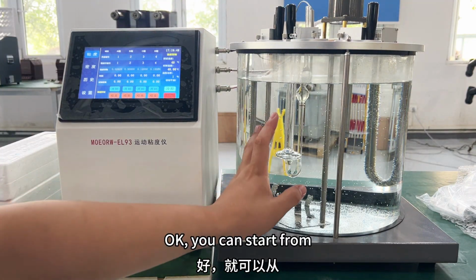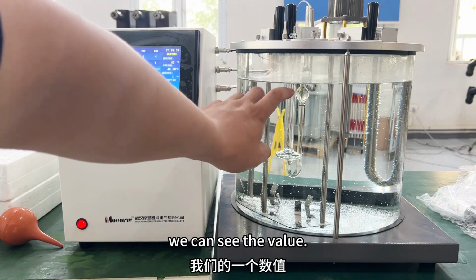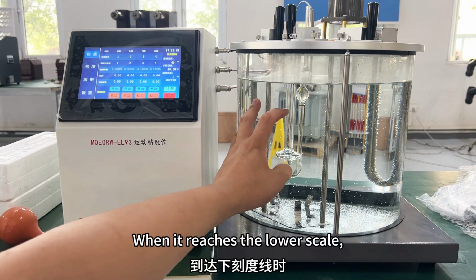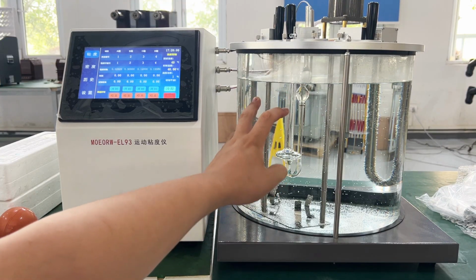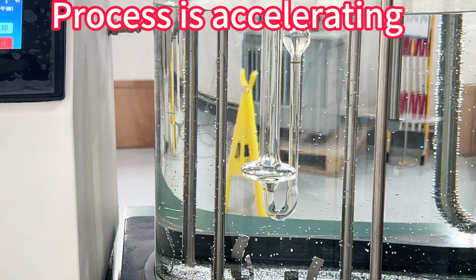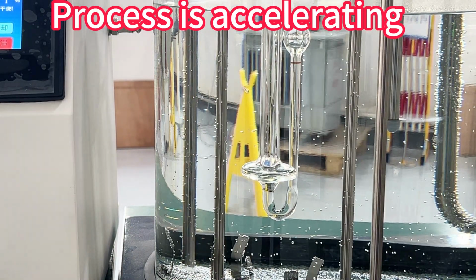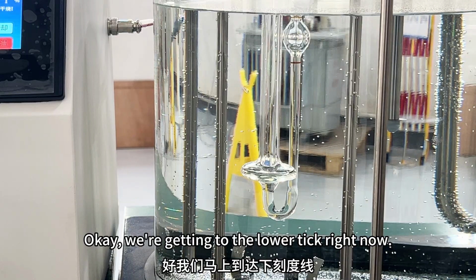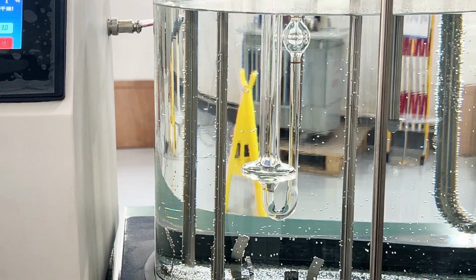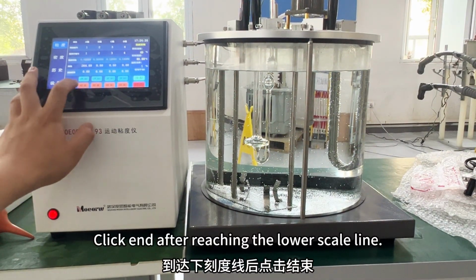Okay, you can start. You can see from this place. We can see the value. When it reaches the upper scale line, we click to start the timer. When it reaches the lower scale, we click to end the timing. Okay, we're getting to the lower tick right now. This place. Click end after reaching the lower scale line.